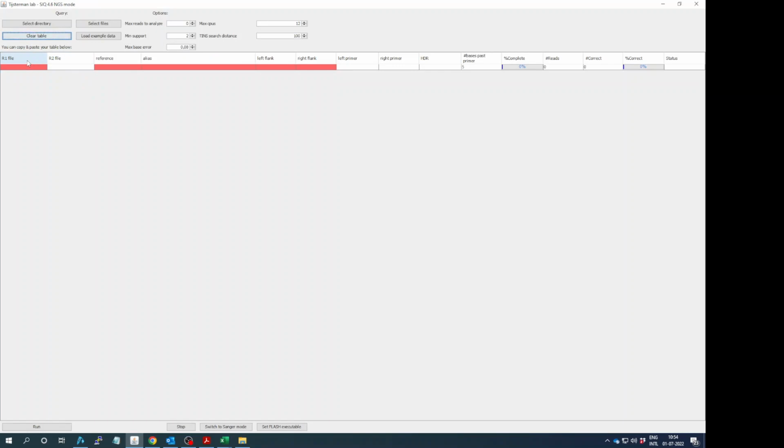So here on the left you see that you have to input the FASTQ file, and then optionally you have a second FASTQ file, which is normally the case when you have Illumina paired end sequence data. You input both data files, and SIQ will actually automatically merge those reads and then do event classification. The header part of the table here is red because the fields are not filled in correctly, and SIQ does not accept this as a valid run.